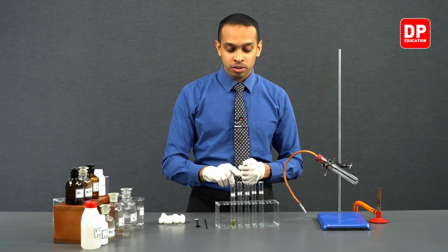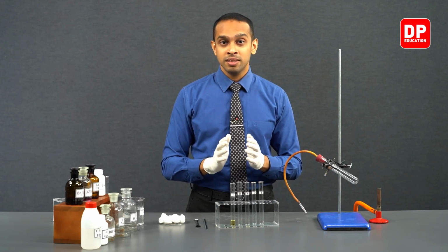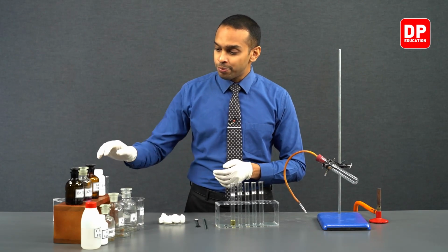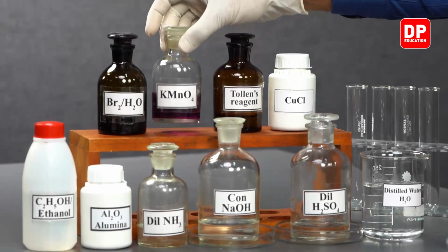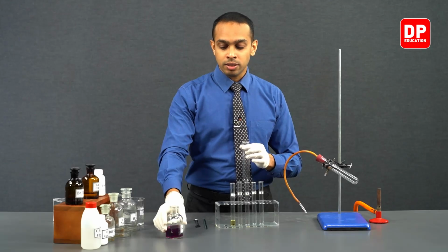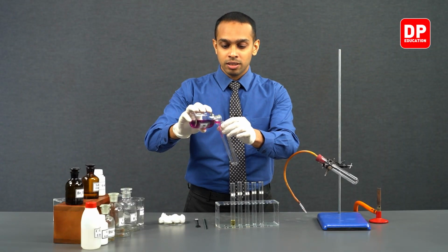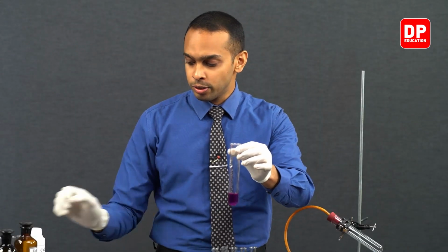Now let's move on to test tube B. In test tube B, we are going to include alkaline potassium permanganate. We are going to take dilute alkaline potassium permanganate. So we have potassium permanganate here. We are going to form a small sample of dilute alkaline potassium permanganate. To produce this, we are going to take a small amount of potassium permanganate into a boiling tube, like so.